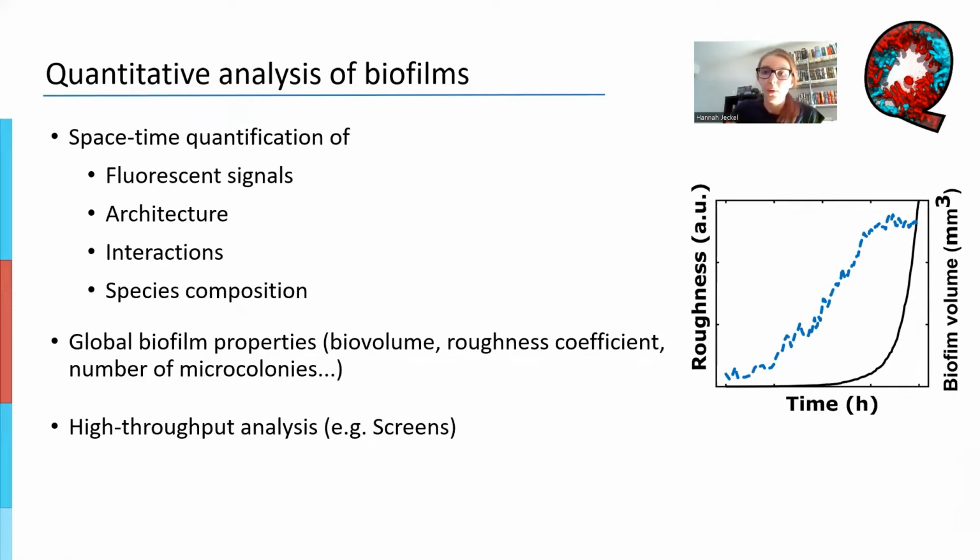And then finally, we also have the possibility to do a high throughput analysis, a batch processing that enables you to run the same type of analysis on a bunch of folders and basically just let it run over Christmas and come back and have it done.